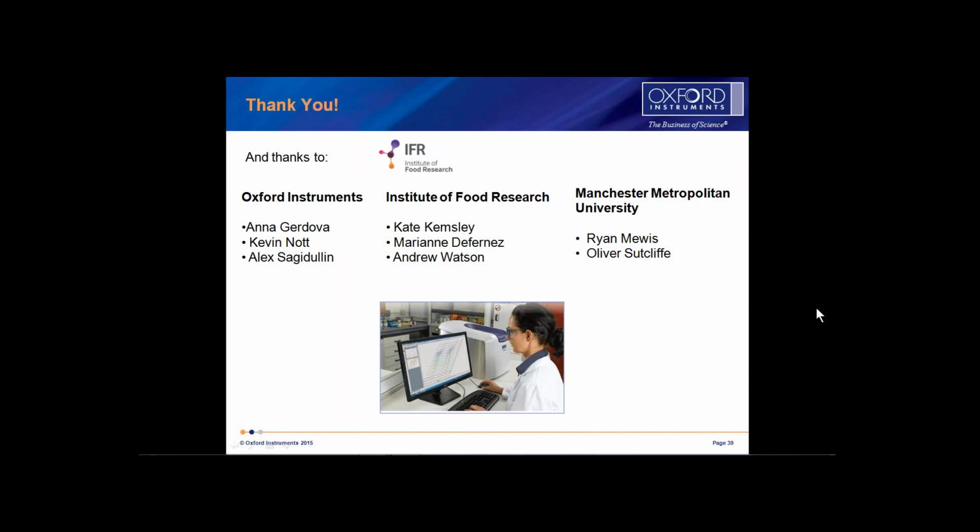In the preparation of the sample of ibuprofen, is another instrument necessary, for example, a dry bath? No, it's simply dissolved in chloroform. Is there a flow cell available for online measurements? No, at the minute, we don't have a flow cell. What range of temperature can you run the samples at? At the minute, we run the samples at ambient temperature.